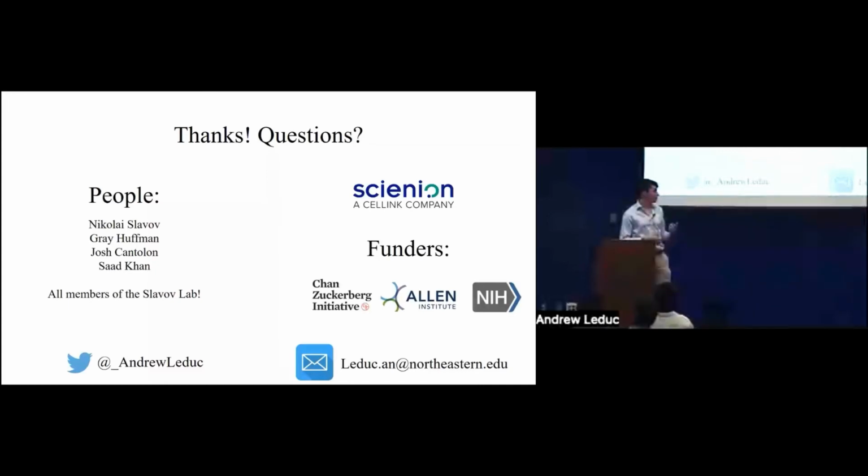And then there are batch effects that are hard to explain. And of course, you do the best you can to eliminate all the sources that you might know about. But in the nPOP work, we found, nicely, that only a limited amount of the variance could be explained from one sample to the next. So yeah, that was nice to have.